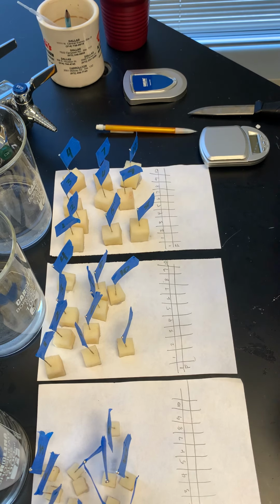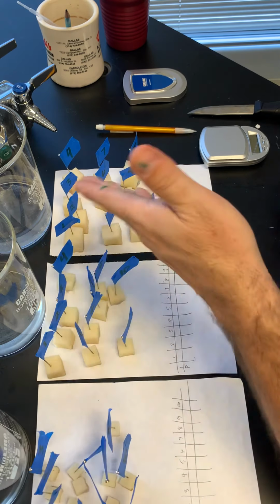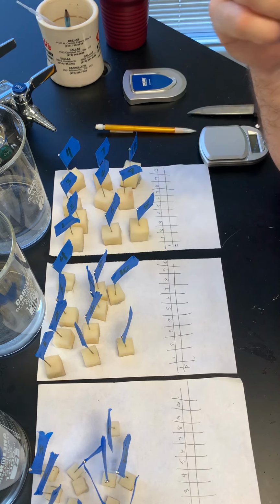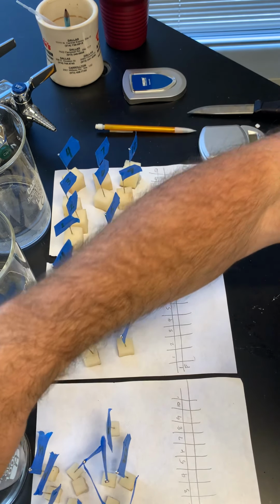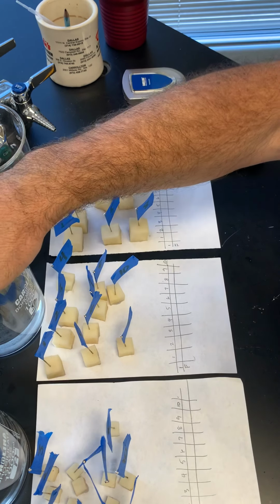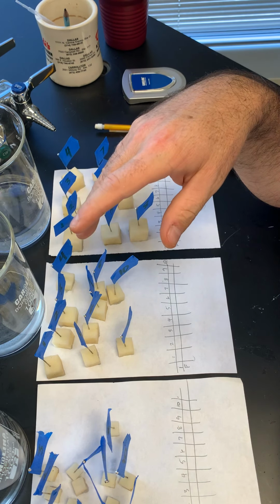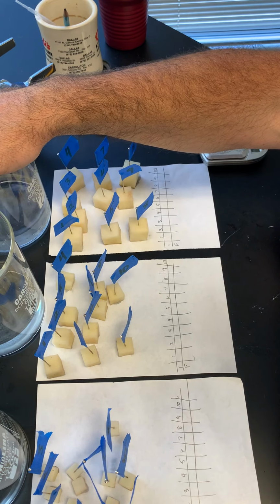We also need to keep other things constant, or controlled variables, like the amount of time they're in this, I would say solution, but it's not. It's just pure water. Temperature is the other variable that you could choose, if you wanted to keep the concentration of the solutes the same, instead of having maybe 5% salt, 10% salt, and 15% salt, or 5% sugar, 10% sugar, and 15% sugar, if you want to make a solution like that. If temperature is your variable, it'd be a little more difficult. You'd have to maintain a temperature, so you'd have to have a hot plate or something. That might be kind of hard to do.